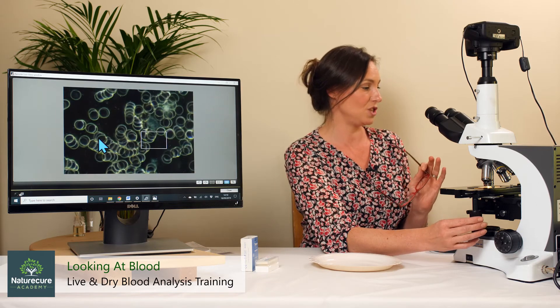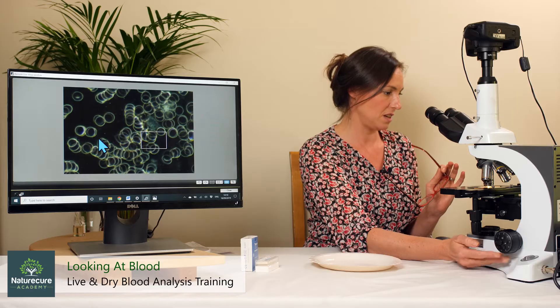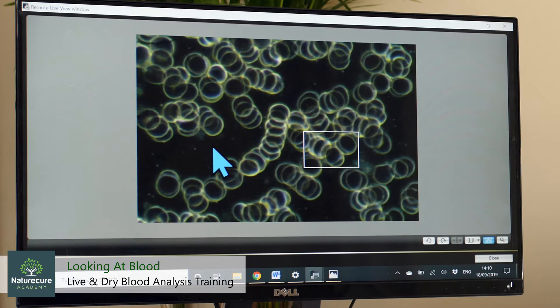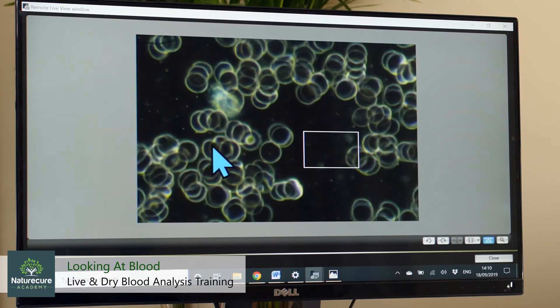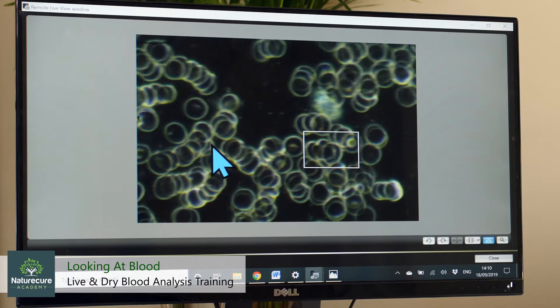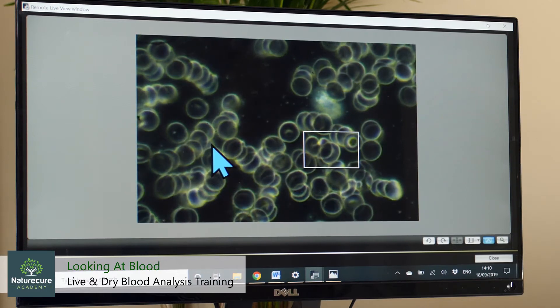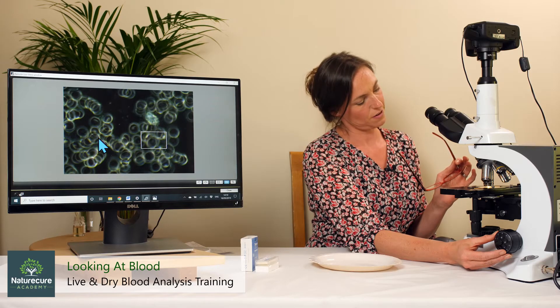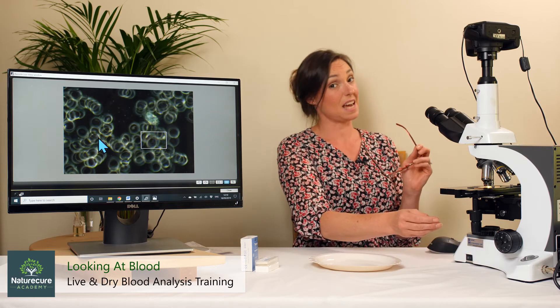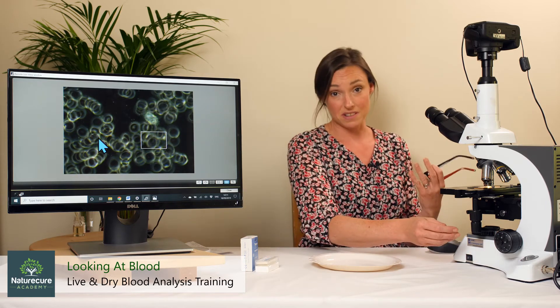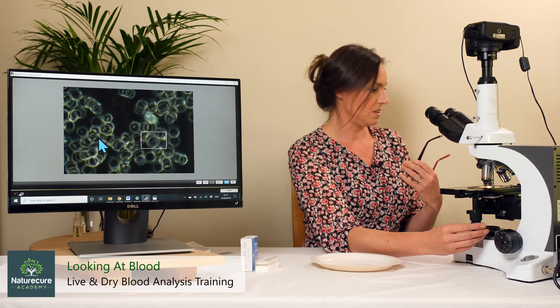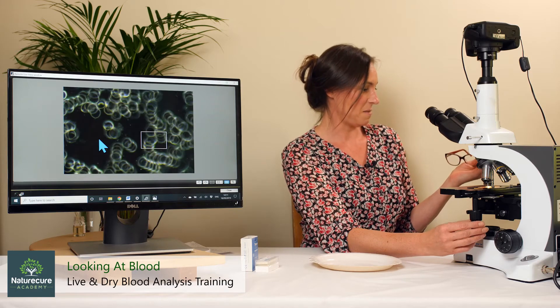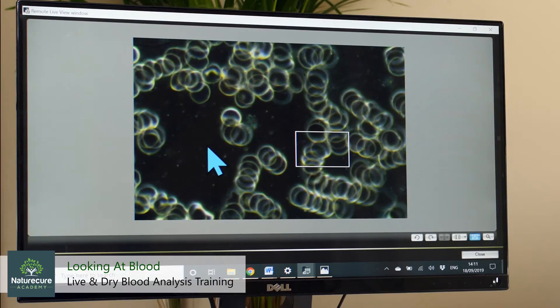For now I just want to introduce you — I'm going to see if I can find a white blood cell for you to see. That looks like a white blood cell. I'm going to refocus a bit to see if we can get some more detail. Yes, it's a very small white blood cell, and that is actually one of the signatures in my blood — I have small white blood cells. That's not unusual for me, but you wouldn't know that until you start looking at blood lots.